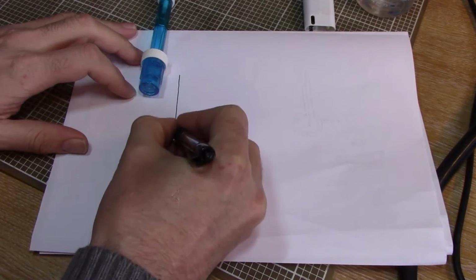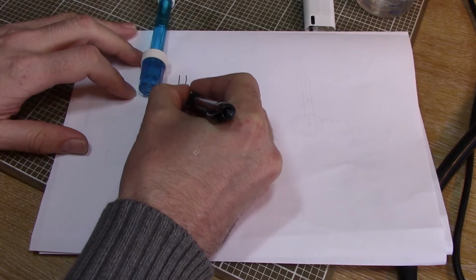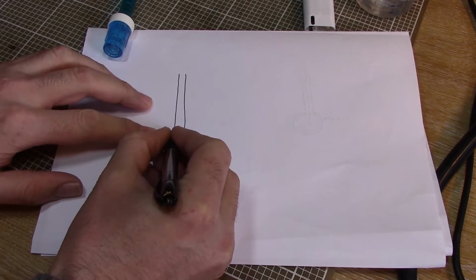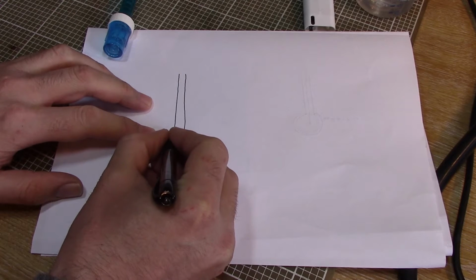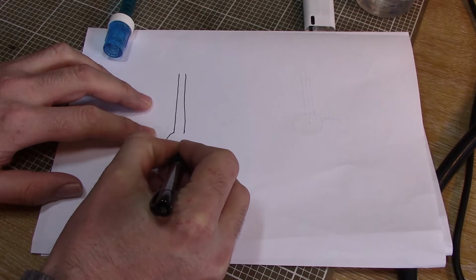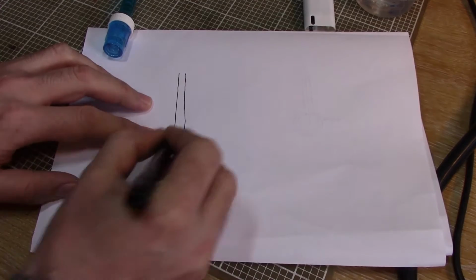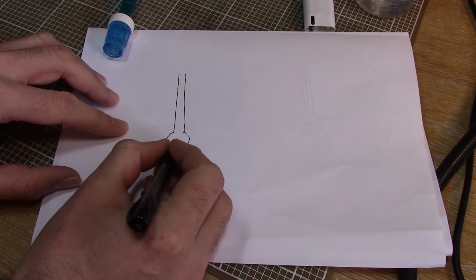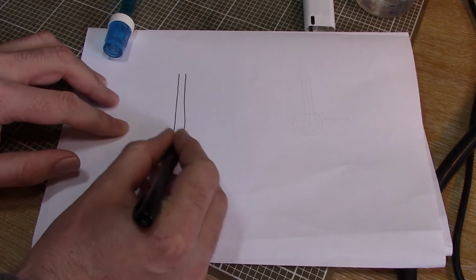So how these electrodes are made, well, first of all, they start off with a glass tube. Nothing special, just absolutely normal glass. Onto the end of that glass tube they add a different kind of glass, special magical glass, and they blow a little bubble. So you end up with a little bulb at the end. And this bubble is very, very thin.